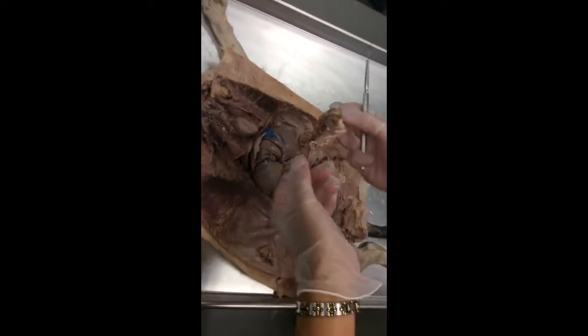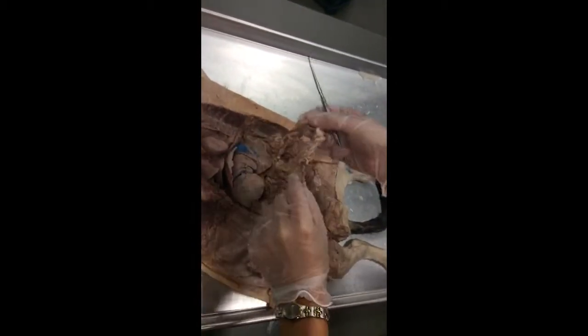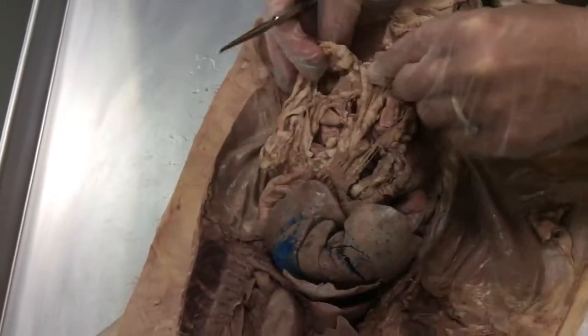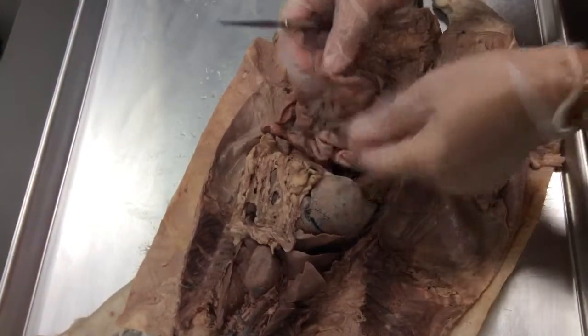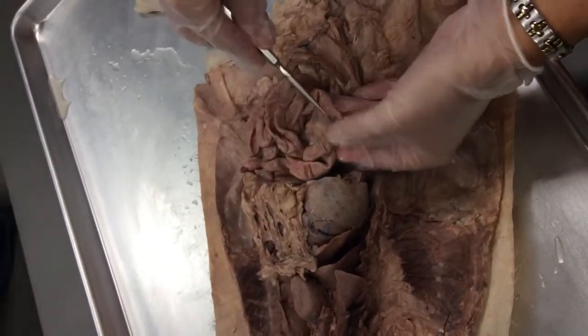Small intestine? No. Pancreas? It looks just like fat. The apron. The apron. So it's the greater omentum. Greater omentum. Yeah. And from the stomach, it flaps over all of this just like an apron. Lift it up. And this one's kind of getting torn up a little bit. And what is this organ here?